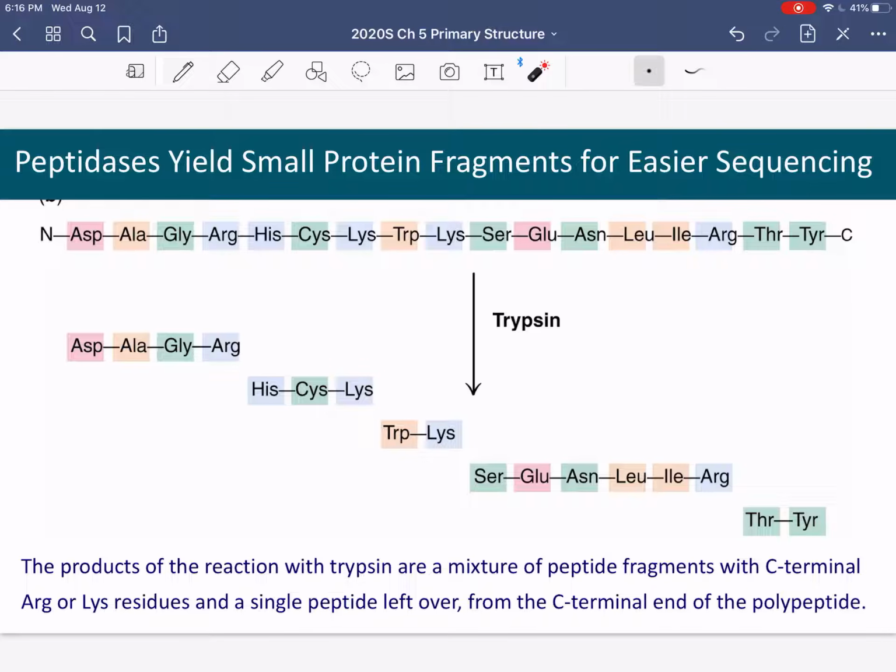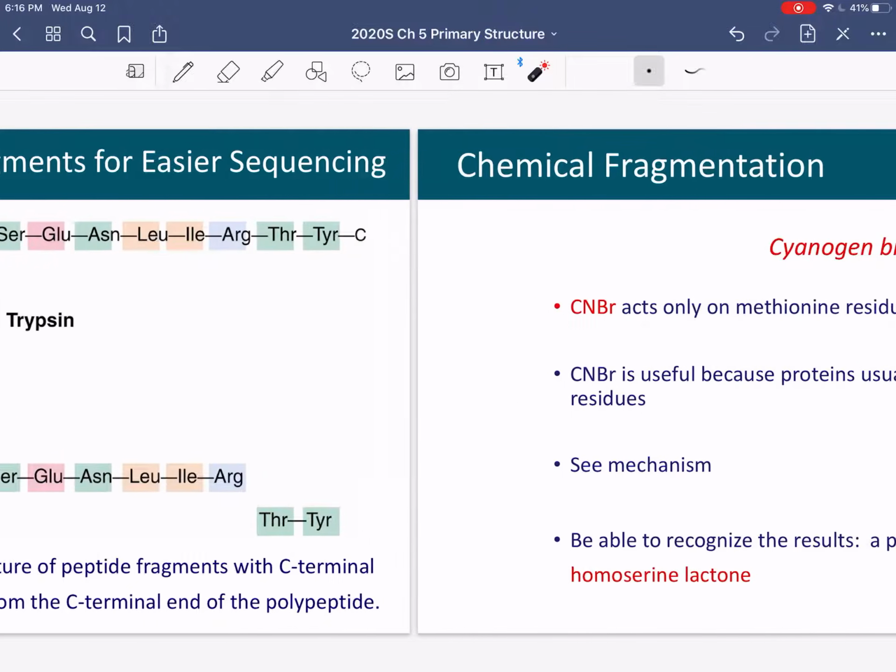And so you'll have these 4 amino acids at the N terminus of this short oligopeptide, this one, this dipeptide, this one, and this one. But if there are hundreds of thousands of these in your reaction vial and they're all mixed together, we wouldn't be able to recapitulate the sequence, right? It could be in any order. And that's why we need step 5.